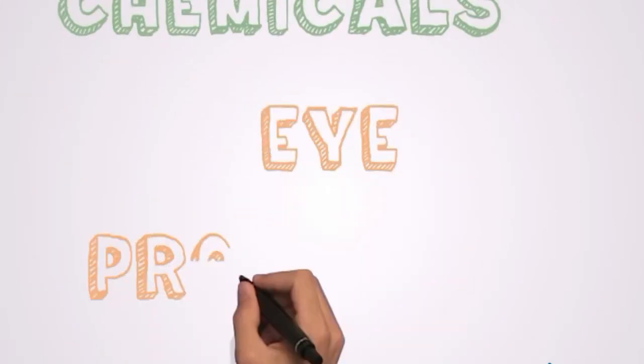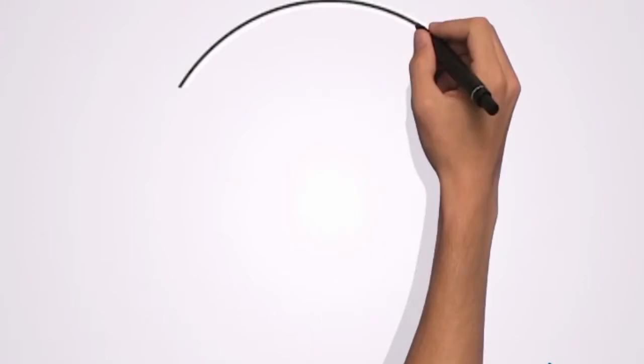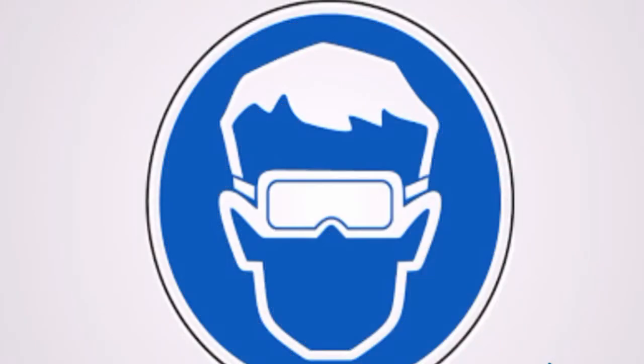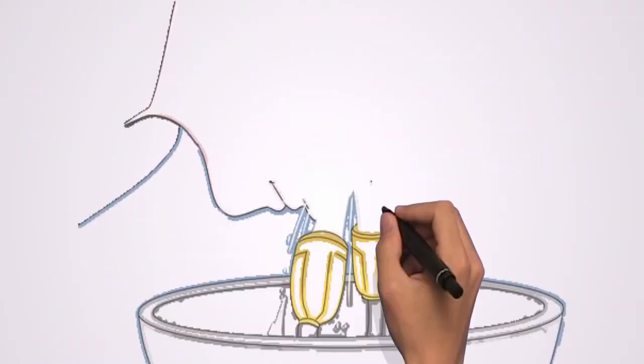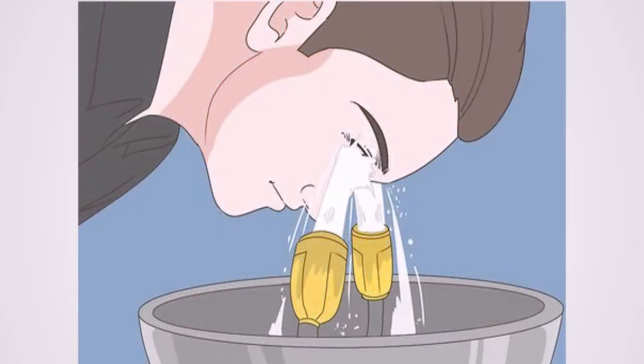Rule 9: Eye protection - Wear safety glasses at all times to protect your eyes from corrosive chemical splashes as well as from flying fragments. In case of injury, immediately flood the eye with lots of flowing water from a sink or fountain for at least 15 minutes. Get medical attention immediately.